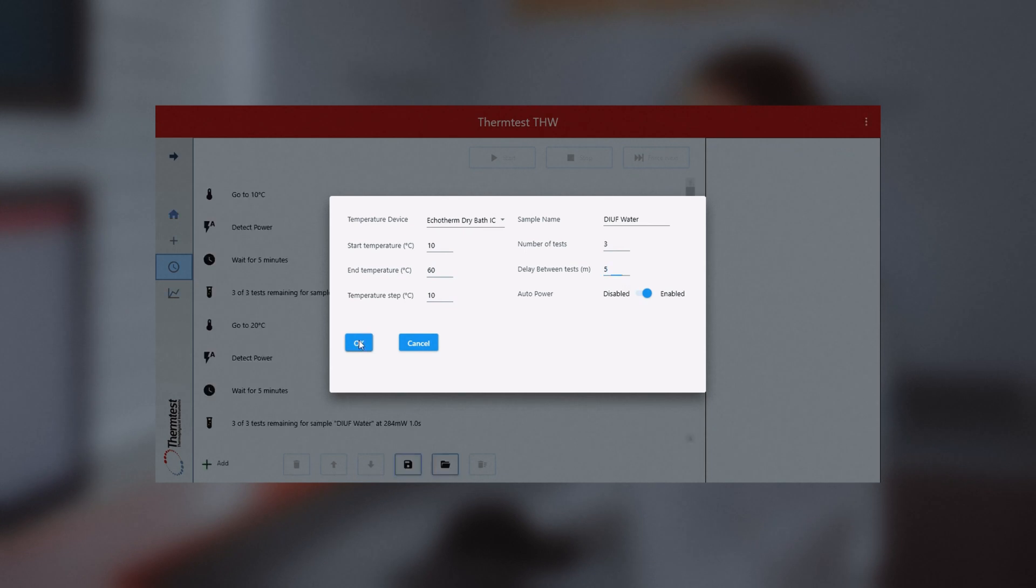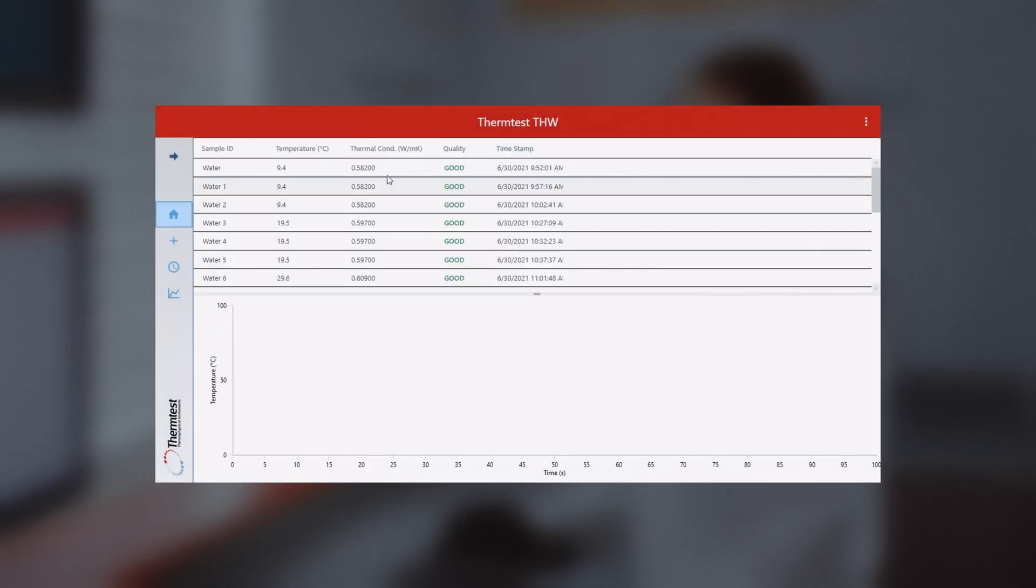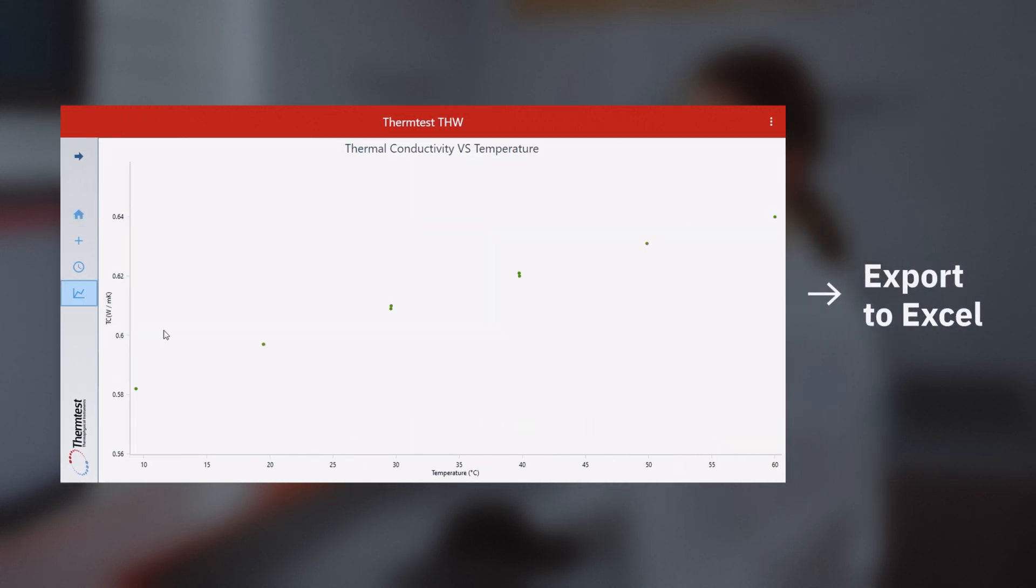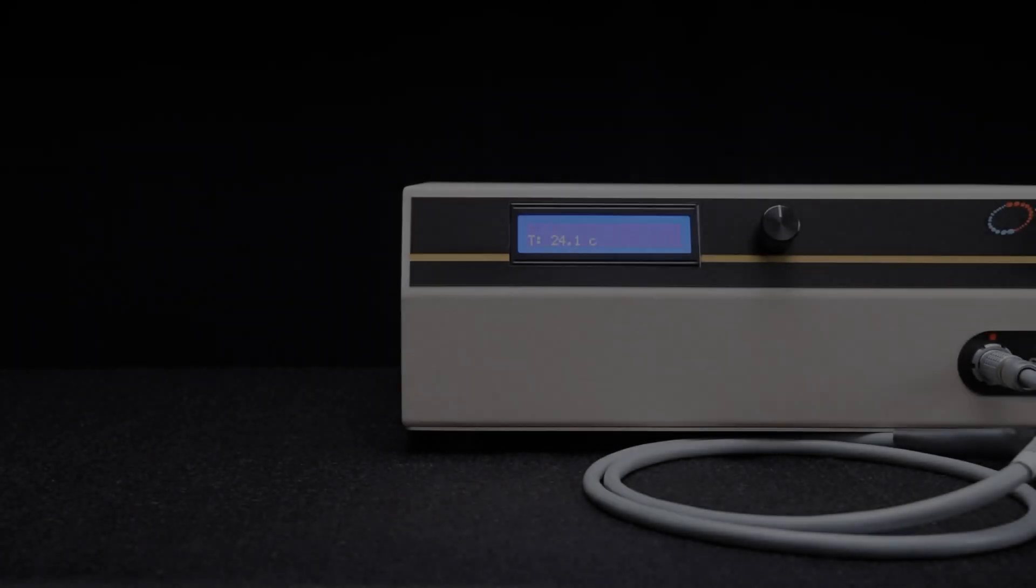Single temperature point measurements as well as scheduled temperature intervals may be performed using the easy-to-use THW software. Using the Windows-based software, users can save, print and export test results to Excel for further processing once testing is complete.